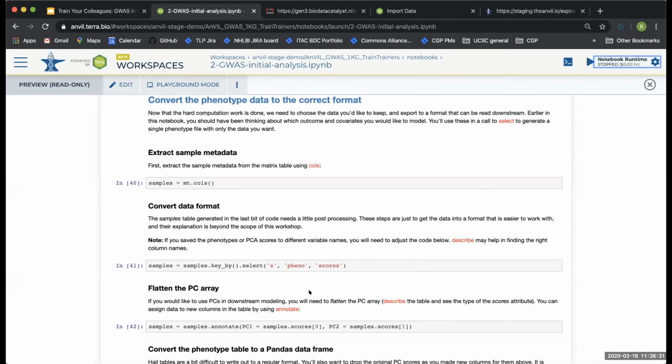But basically we have a file of phenotypes that has the subsetted phenotypes that we're interested in. We have potentially a new VCF where we've filtered for, say, only common variants. Maybe we don't have a high enough sample size to test for rare variants. We have the actual sample IDs because maybe we filtered out specific individuals because they had missing data and so on. So again, because the Terra user interface is a little bit hard to get accustomed to, we're trying to show researchers how to create a new data table.